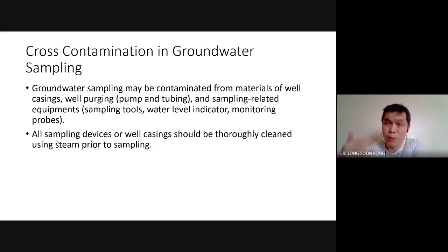So why would we even need to do all those purging and also stabilization? That is because we want to ensure that there's no contamination. So where does the contamination come from? From your equipment, from the walls of the tube. I consider that part of the equipment.